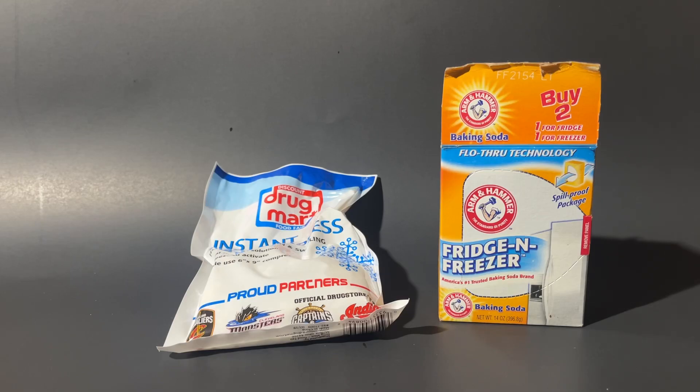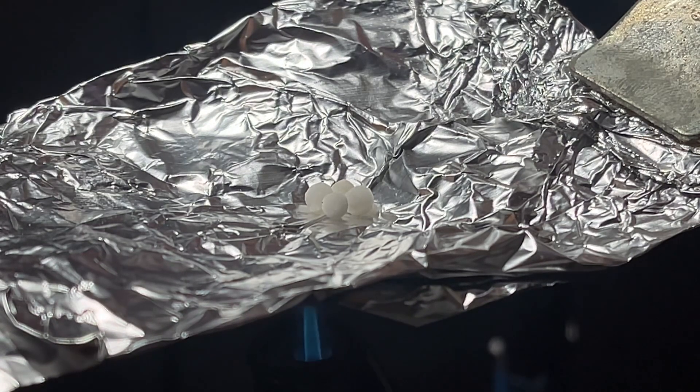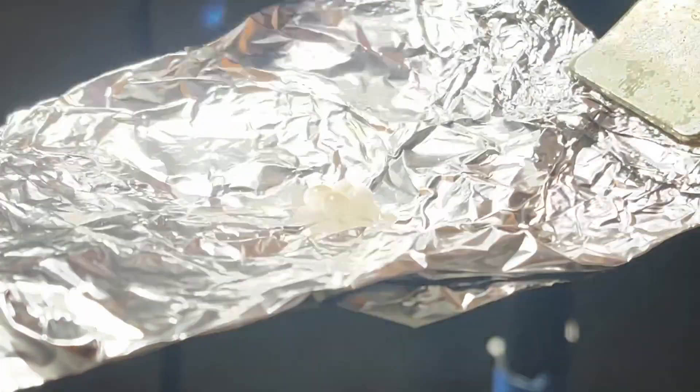To start off, what I'll need is sodium bicarbonate, or more commonly known as baking soda, and I'll also need ammonium nitrate, which can be found in America as cold packs. And if you don't live in America, you probably can't find it because of its use in explosives.